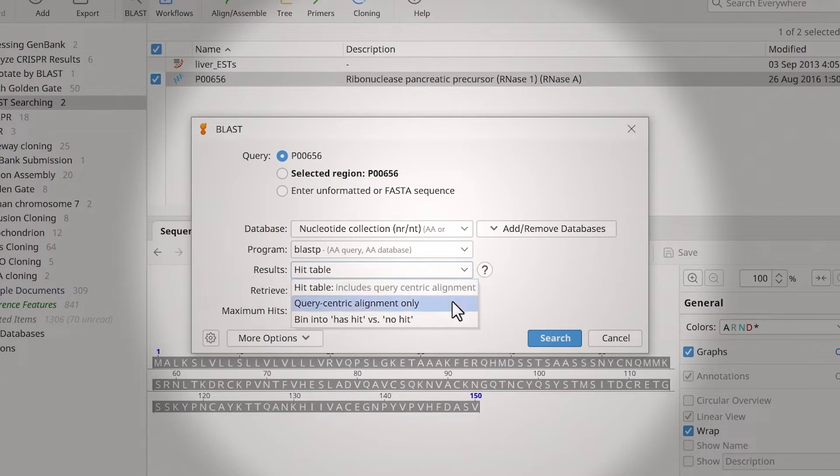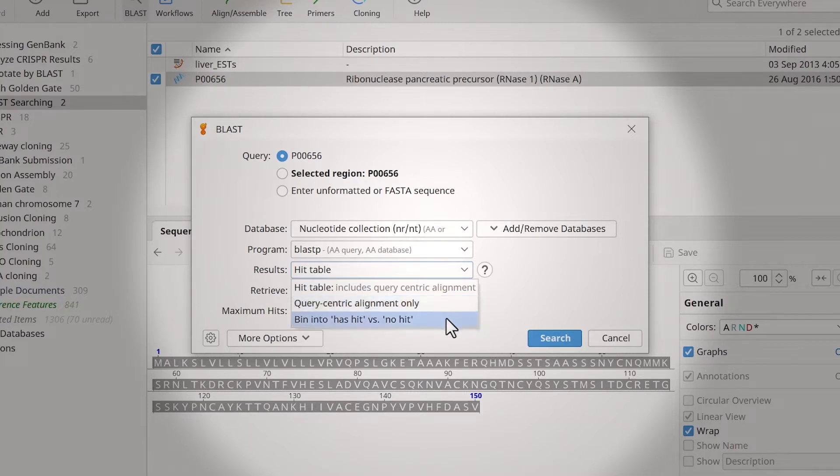Query-centric alignment only is well suited for large batch searches and doesn't include a hit table. Bin will return two sequence lists: a list containing queries that get hits in the database, and another for queries that do not have hits.